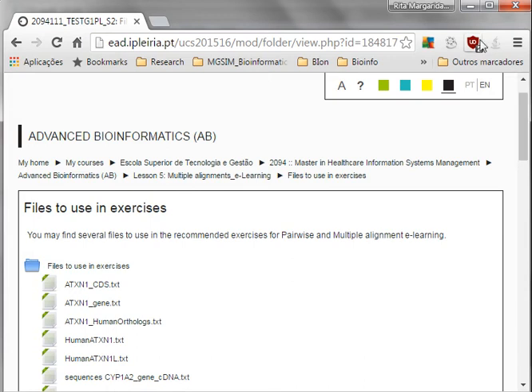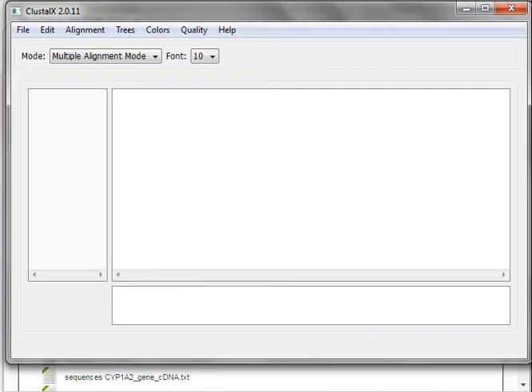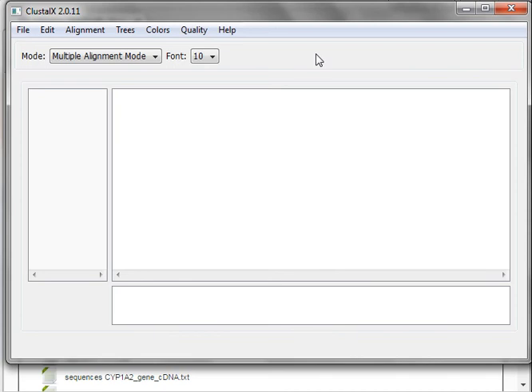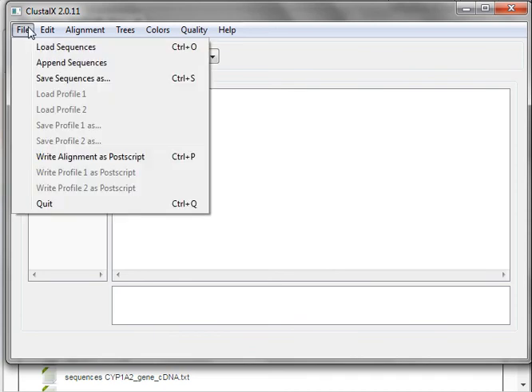One of the softwares that you can use to do a multiple alignment can be Clustal. Clustal you can download using the instructions that you have on your written work. To perform the multiple alignment, after having installed Clustal, you can go and load the sequences.